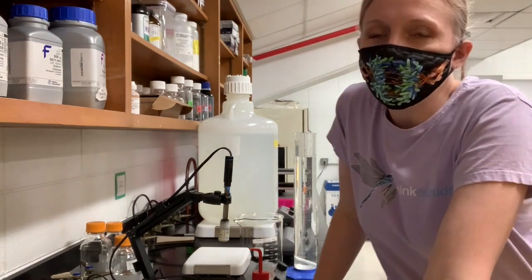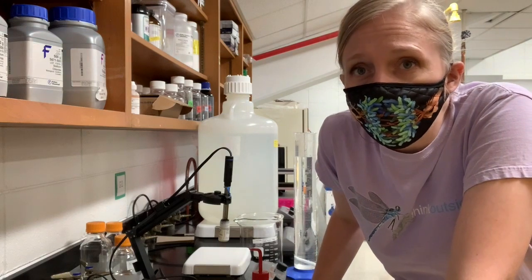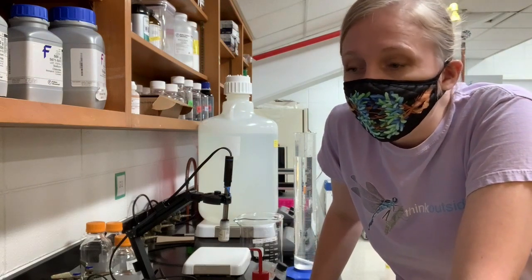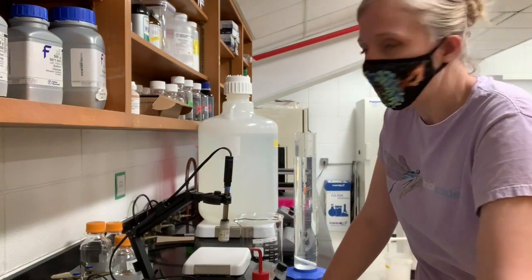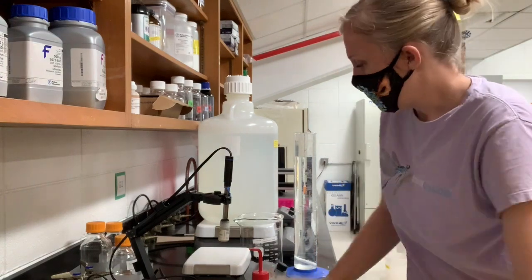I should mention that the ultra pure water just has all of the ions and chemicals removed from it by filtration. So if you take water from the tap, it has many impurities. You can remove a lot of those to make deionized water, and then deionized water is polished further to make ultra pure water. So that's what we use for making solutions and as a base for our planarian salts too.